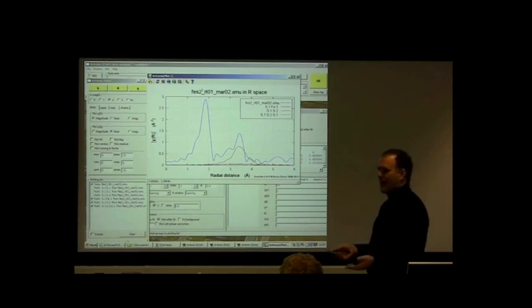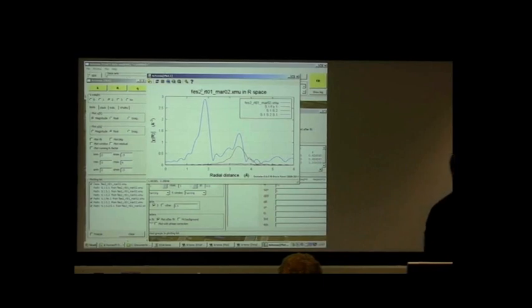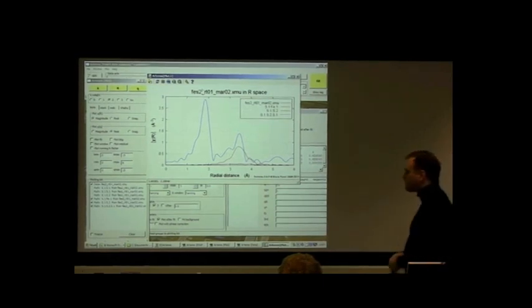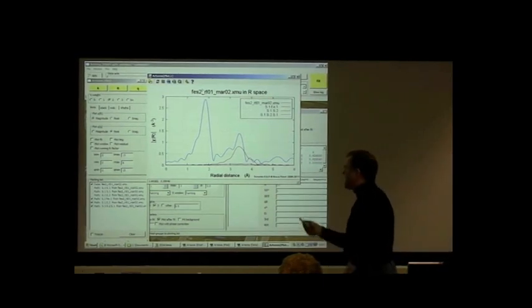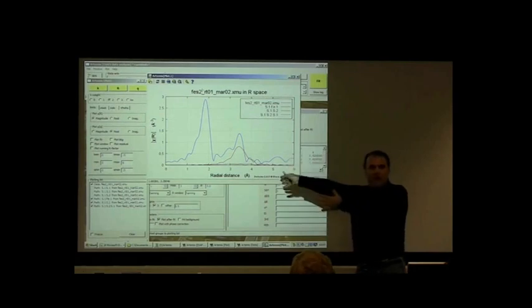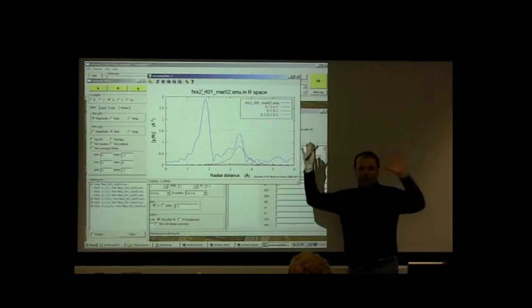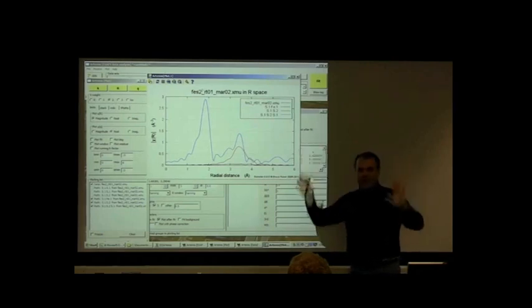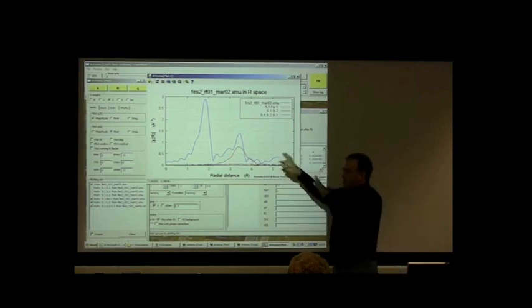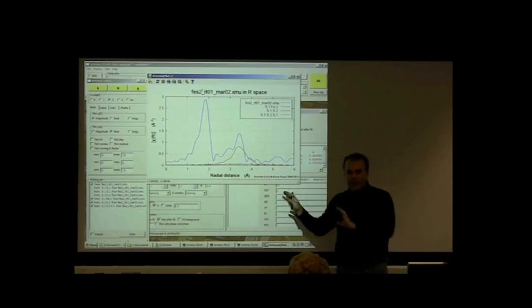So that tells us, well, I guess there's 3 things that I want to highlight at this point. Thing 1 is that, again, the blue line is not a radial distribution function because, look, there are big multiple scattering paths that contribute. If it were something like a radial distribution function, then we would only see the contributions from the single scattering paths, and that's not the case. There are clearly important multiple scattering paths. The Fourier transform of chi of k is not a radial distribution function.